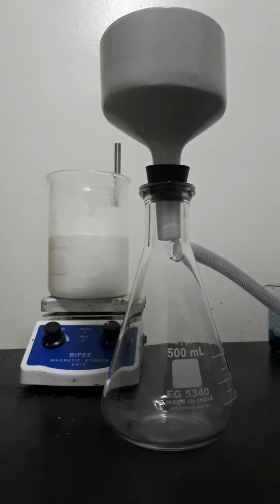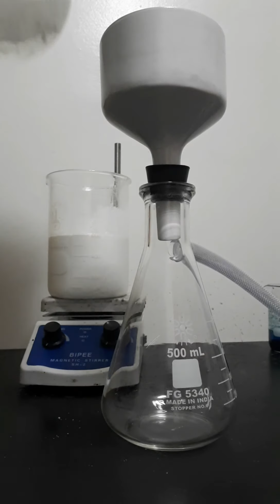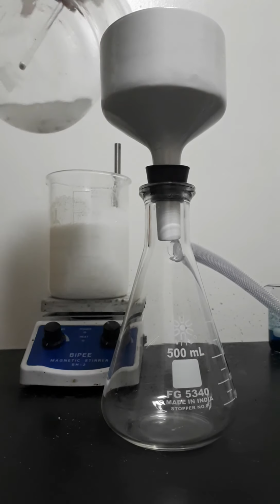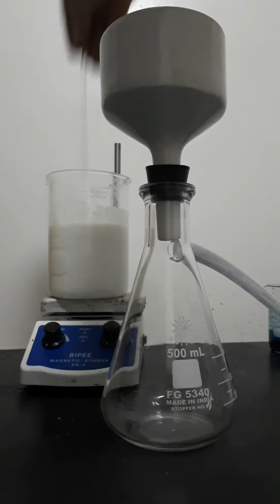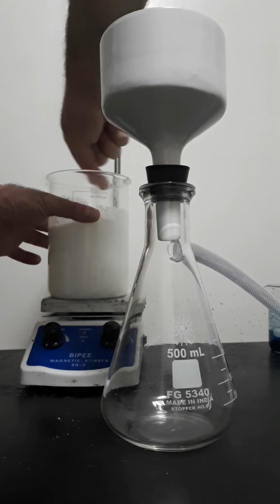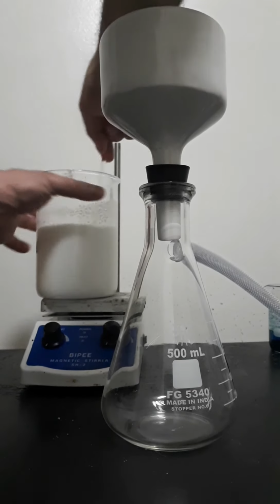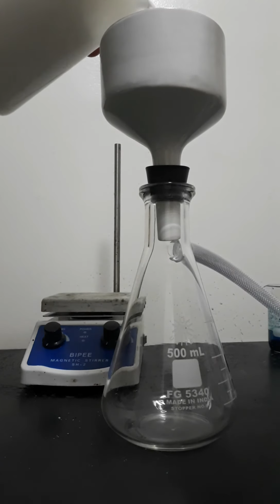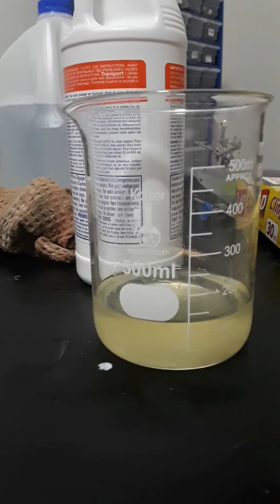filter the nitric acid that we have produced. It smells very much like nitric acid. And add a little bit more water there. And I'm using a vacuum filter and a little manual pump to take care of that. So here is the nitric acid that I've made.